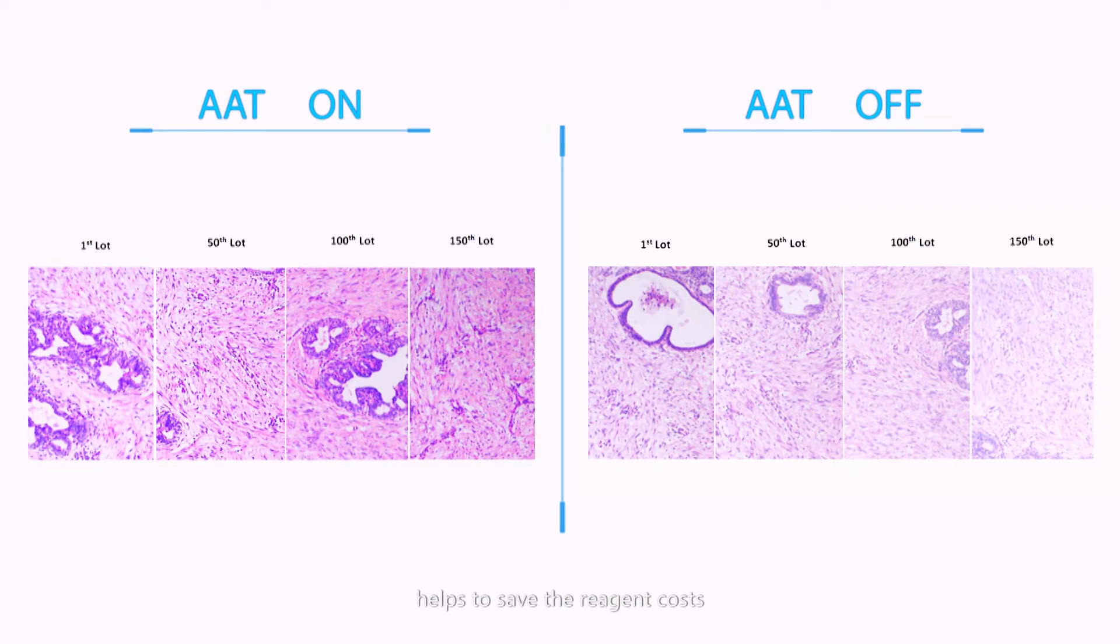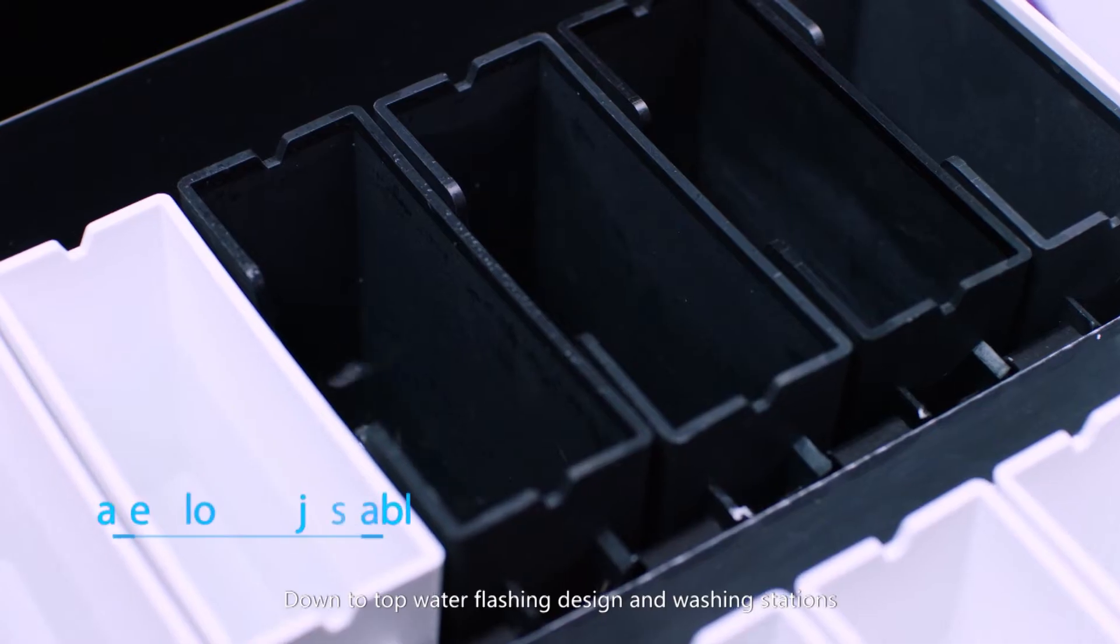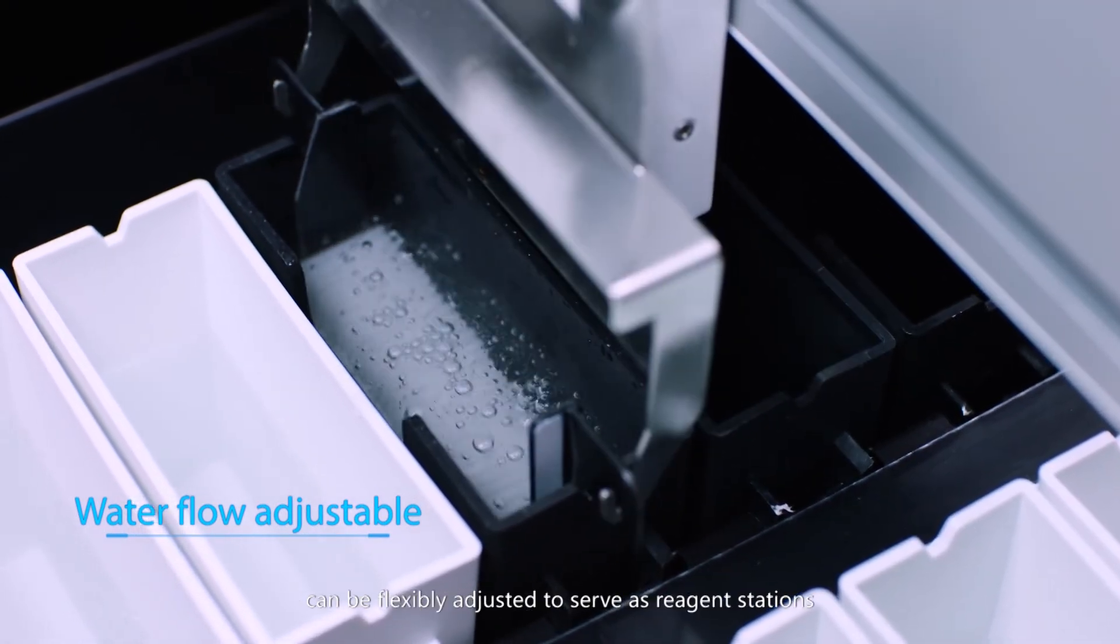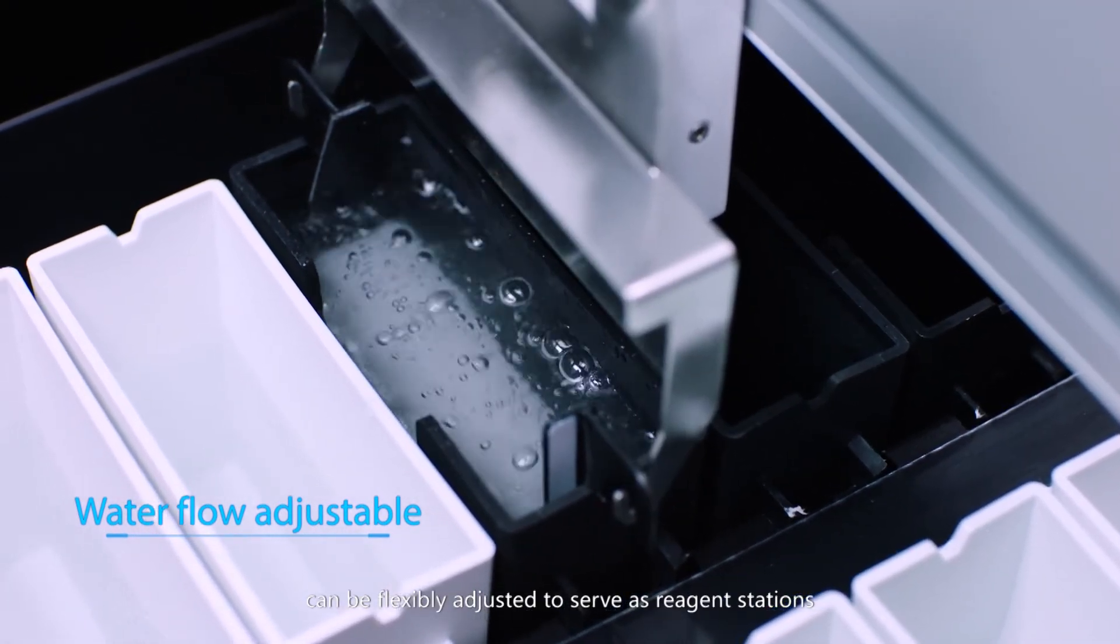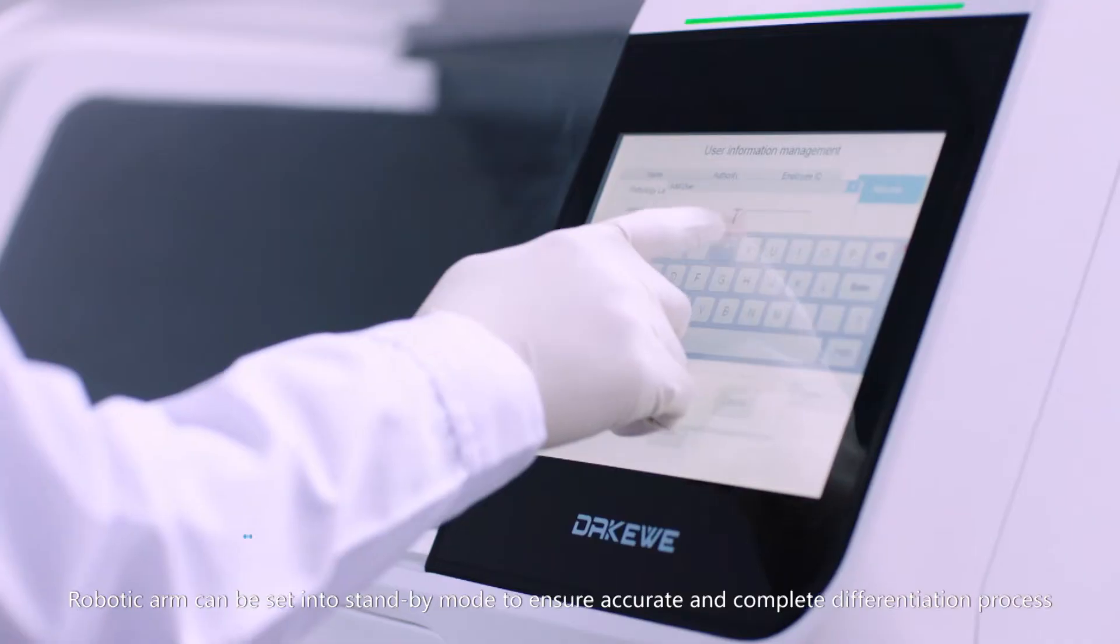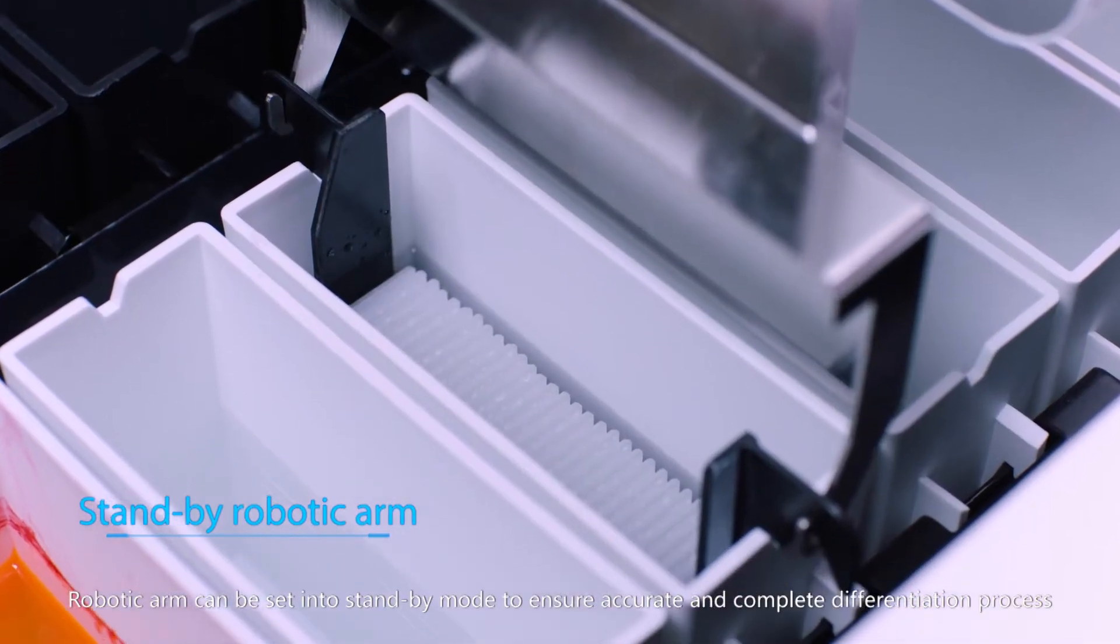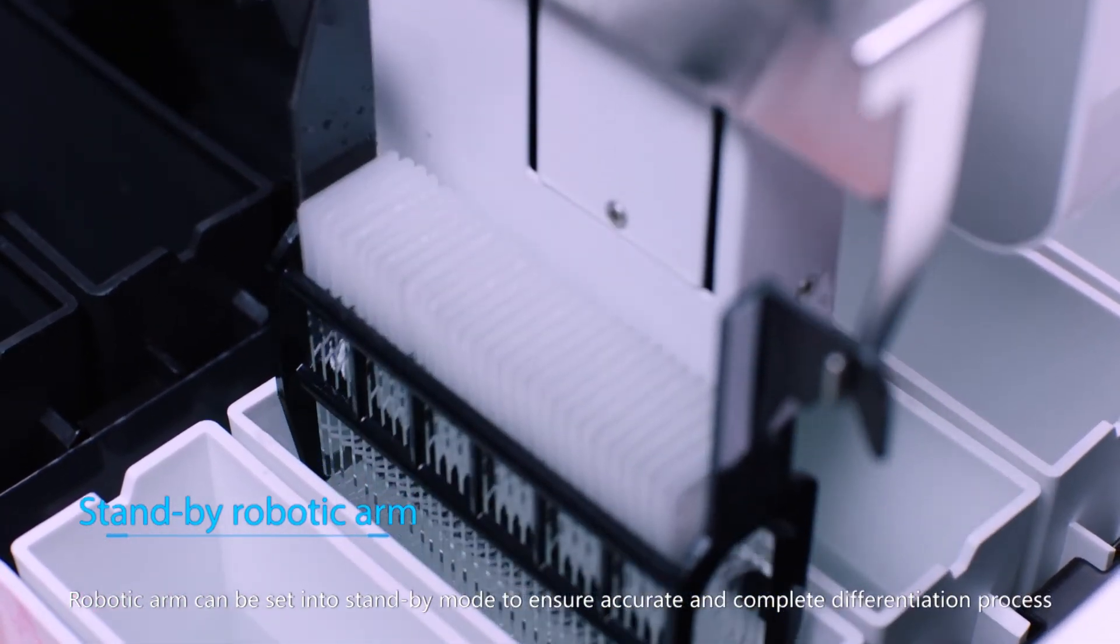Down to top water flushing design and washing stations can be flexibly adjusted to serve as reagent stations. Robotic arm can be sent into standby mode to ensure accurate and complete differentiation process.